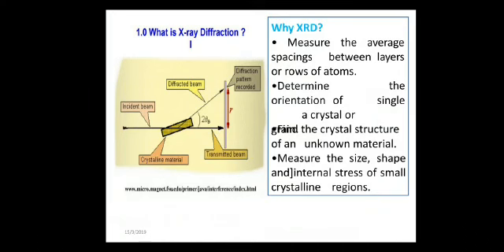size, or strain or microstrain effects in bulk and thin film samples, and quantification of preferred orientation in thin films. Also, we use it to determine the ratio of crystalline to amorphous material in bulk materials and thin films. And also in characterization of crystalline identification of fine grained minerals such as clays and mixed layer clays that are difficult to determine optically, and determination of unit cell dimensions and measurement of sample purity.